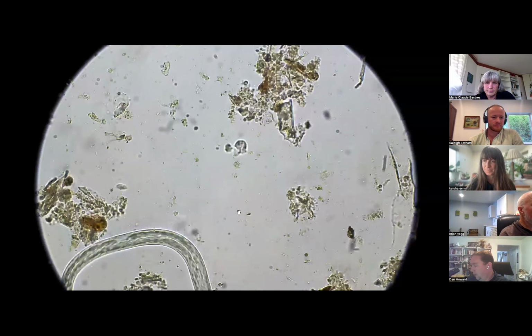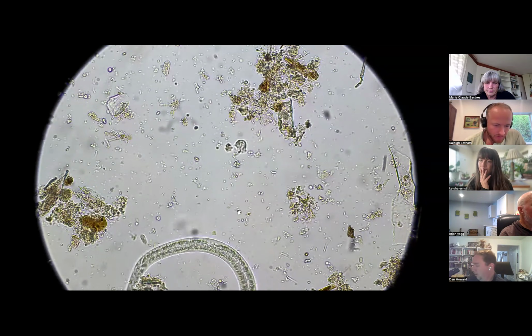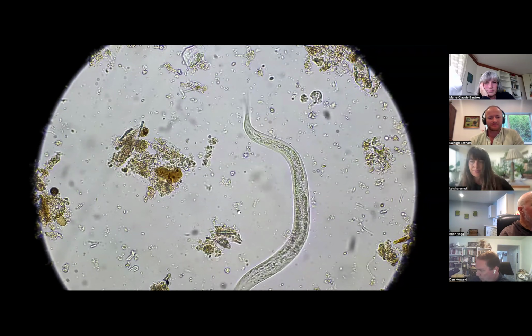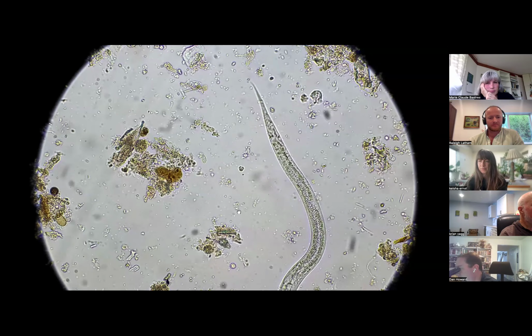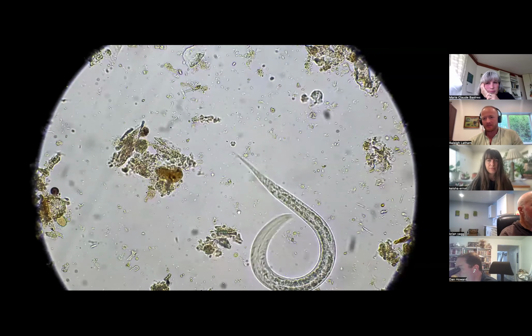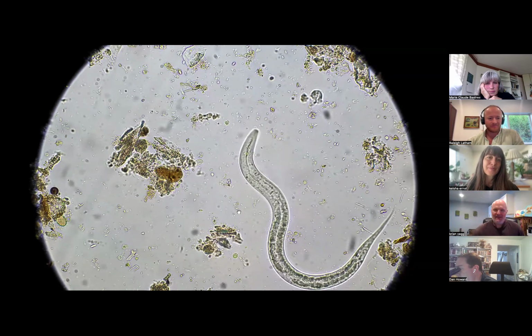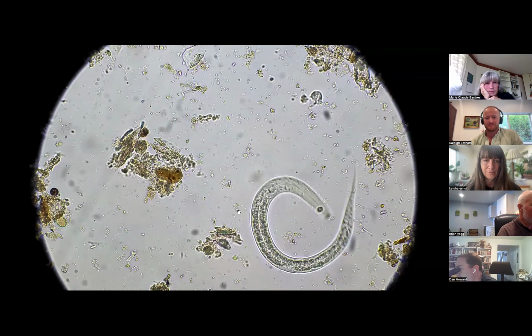Oh, look at that right there. Hello, bumble friend. I think that's actually a cilia getting moved around, because I can see the cilia. You guys probably can't see it from the camera, but that is definitely a cilia. Gosh, this is such a good nematode extract sample. When we do our nematode extract, I should probably make an extract of the vermicompost, because there's a lot of good guys in here.